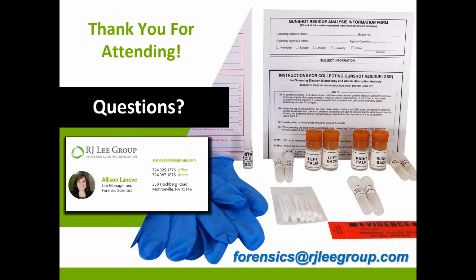The short answer is, unfortunately, no, it cannot. Primer residue, lead, antimony, and barium are the three major components that are going to be in the majority of ammunition that we see. So most often we're looking for lead, antimony, and barium, and we cannot track that back to a particular ammunition or, unfortunately, even a particular firearm.